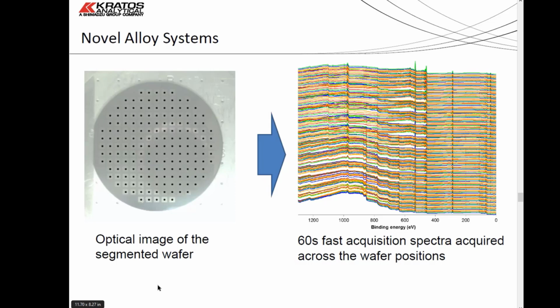So once again, we had this sapphire plate with distributions of different concentrations deposited across the plate. You had nickel, titanium, and cobalt in different orientations in the deposition chamber, and the assumption was that this gives an even distribution in different places.